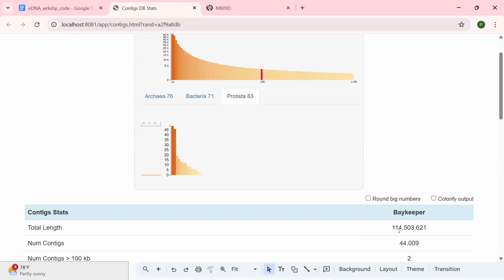So, just to double check, it'll take all your FASTA files for your versions, match them up for you, clean off the ends, look for mess-ups like that, then run on the database, do all that for you, and then run it out. Yeah. Okay, very nice. Yeah, you can program it to choose which databases you want. The scripts that I have in my protocols are for certain databases, and I tell you which databases I've asked it to do, but you can ask for different databases, and it takes it all the way from cleaning and pairing to annotating.